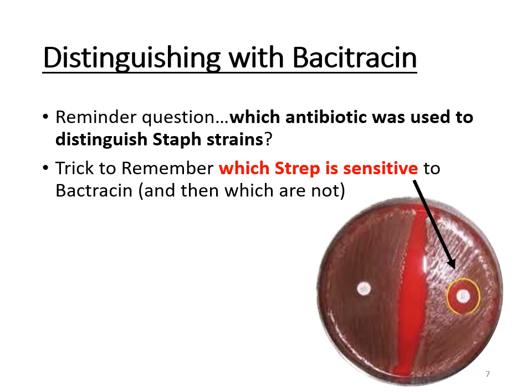So whenever you see a plate with a Bacitracin disc and you see a circle around it, a zone of inhibition, where that disc has killed off or eaten up all of the bacteria around it, that tells you this bacteria here is pyogenes.